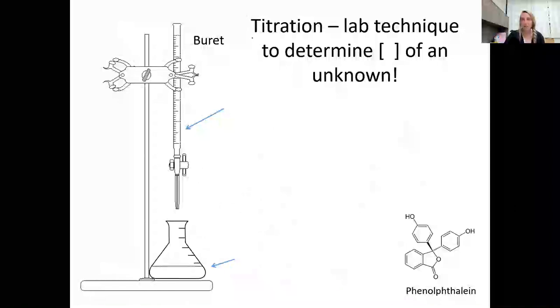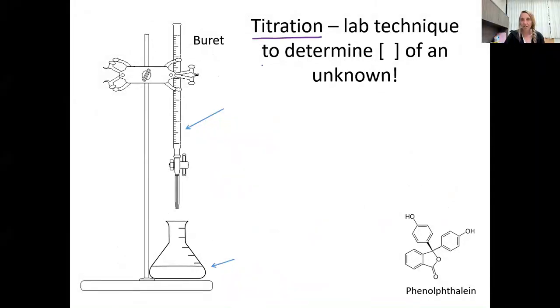That I want to talk to you guys about is titration. Titration is a very specific lab technique that's used to determine the concentration, or moles per liter, of an unknown. Here's the setup, and some of you that have been in lab or watched some of the lab videos have seen this type of setup.